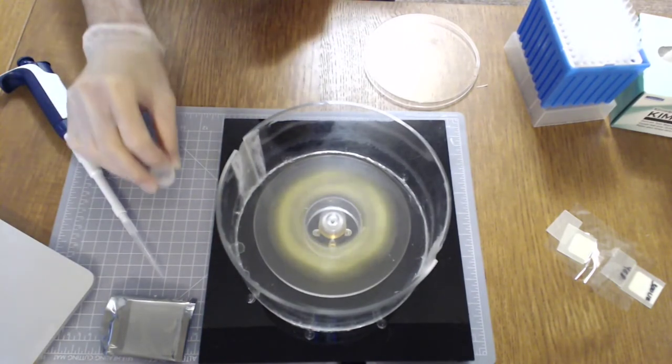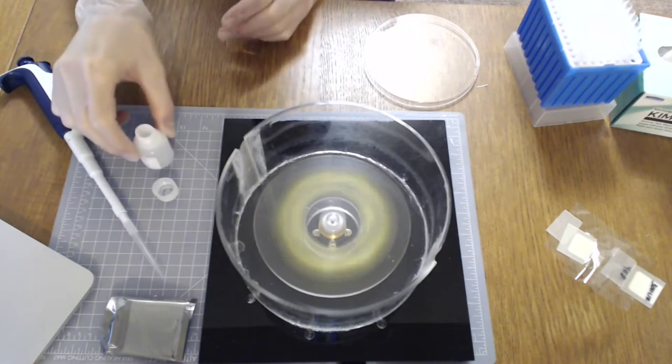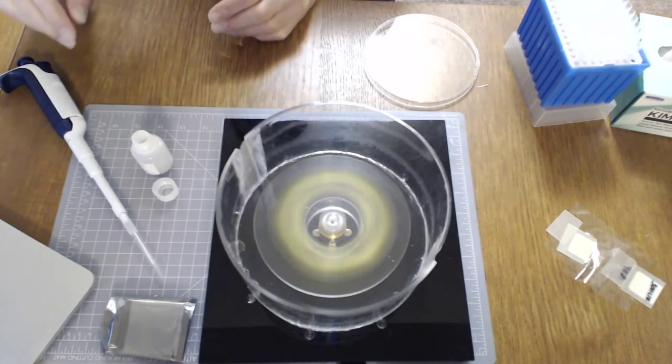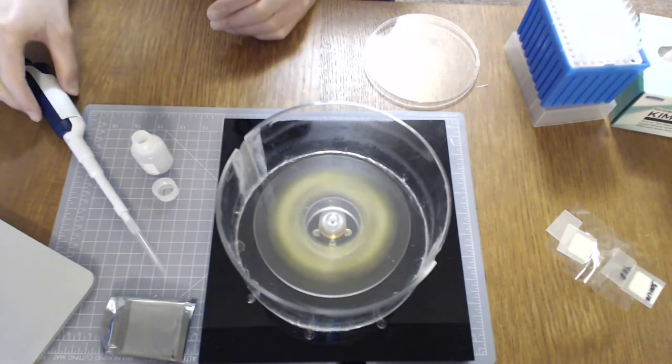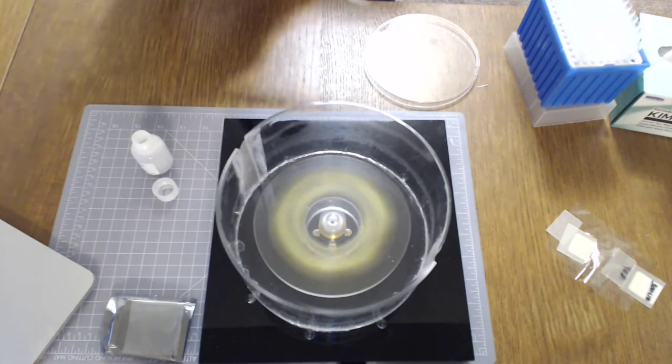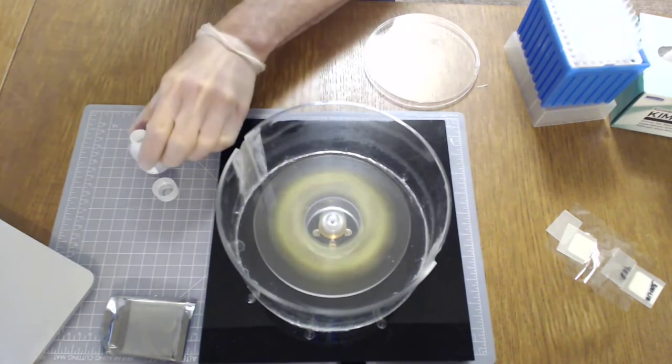Once it's up and spinning at thousand rpm we're going to dispense 450 microliters of the fluoropel hydrophobic coating onto the center while it spins and then let it spin for about 30 seconds afterwards to spread.